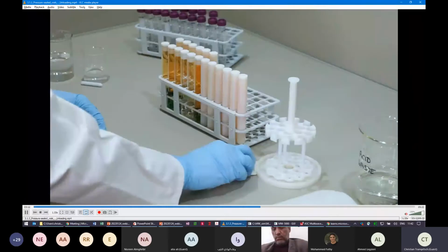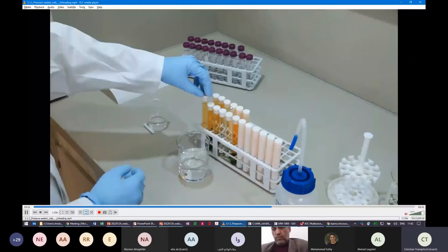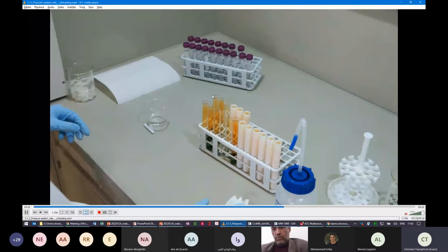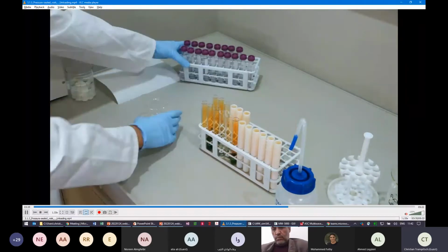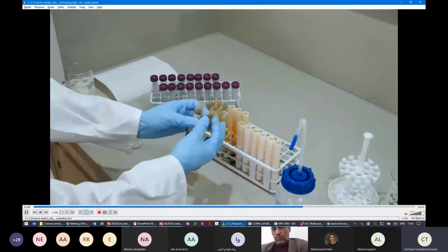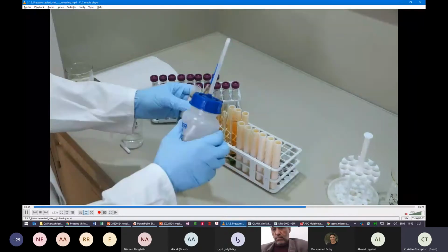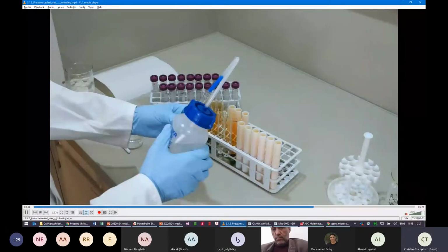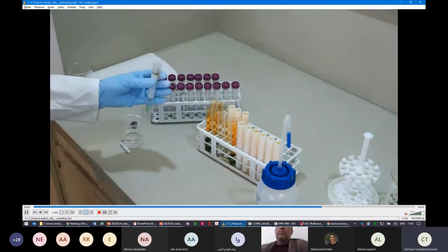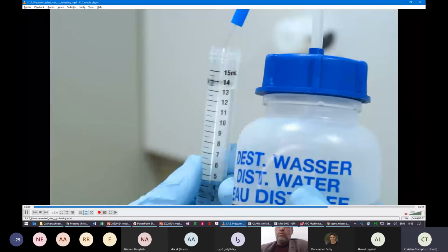Again, we have some acid condensate droplets on top on the plug-on caps, but we discard them. We just put them into some water where we rinse them so they're ready for the next use. Then we dry them a little bit, and then we start to transfer the solution from every individual vial into some autosampler vial, for example. The principle is the same. We quantitatively transfer the solution from the vial and fill up to a defined volume, in this case 15 milliliters, but you can also use any other vial you want to use. In this case, we're using 15, and that's it.